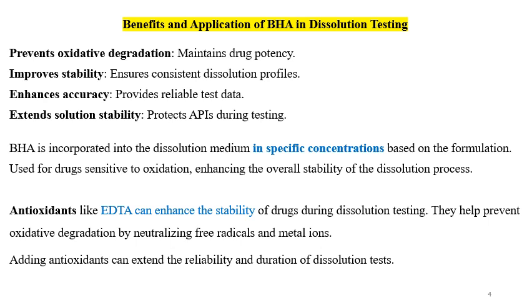Other antioxidants or other chelating agents which can stabilize the drug in the dissolution media and prevent degradation are like EDTA. EDTA prevents oxidative degradation by neutralizing free radicals and metal ions. Adding the antioxidants can extend the reliability and duration of dissolution tests.